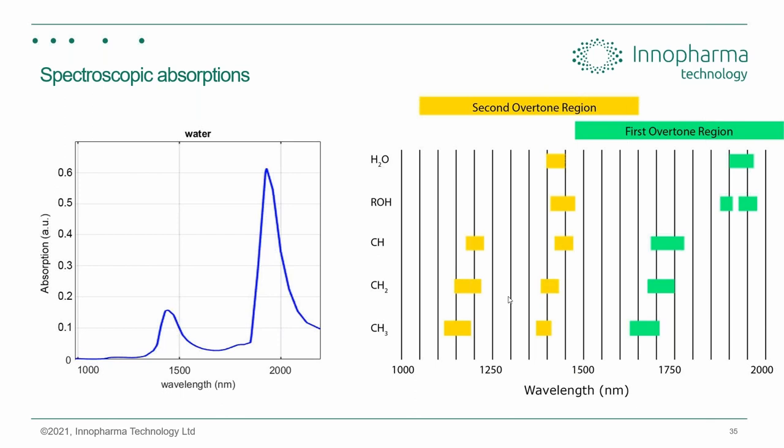By near infrared region, there's the electromagnetic spectrum. These are a range of different wavelengths. The light that we can see is a subset of this spectrum, from about 400 nanometers to approximately 750 nanometers. Then there is the invisible light range, which we can feel but we can't see. There is in fact invisible light at both ends of that spectrum: ultraviolet light that we have to protect ourselves against because it's damaging to skin, and infrared light that we can feel. We can feel heat being transferred through infrared light, and you can see it with an infrared camera.